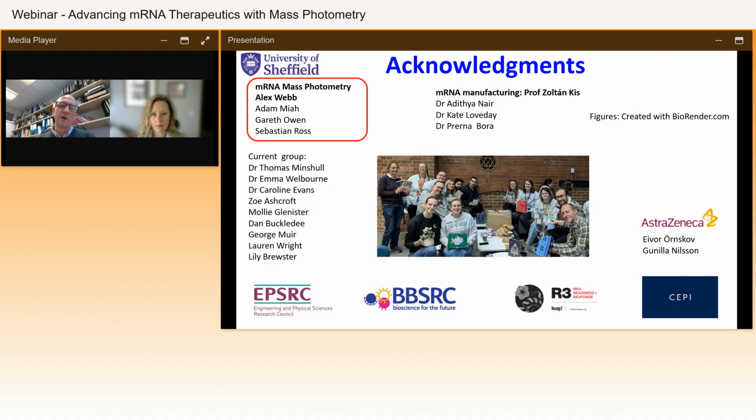And obviously, if we use too high a magnesium concentration, then that starts to cause potential degradation of the RNA. So again, there's a bit of a balance. There's quite a lot of data in the literature optimizing that concentration to use. We chose to use physiological magnesium. And more importantly, when it comes to doing the separations and purification, it is important to remove the magnesium post the chromatography, because long-term storage with magnesium certainly causes degradation of the RNA.